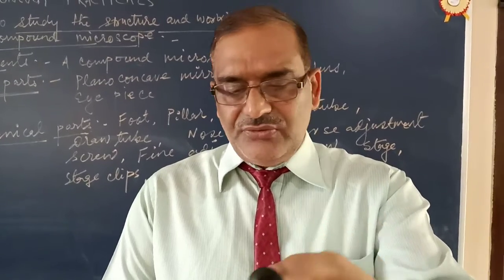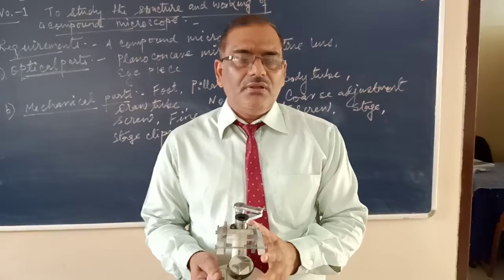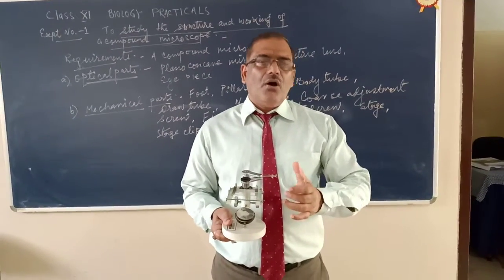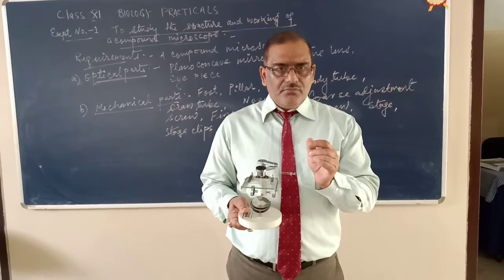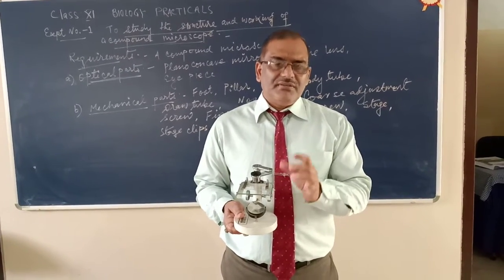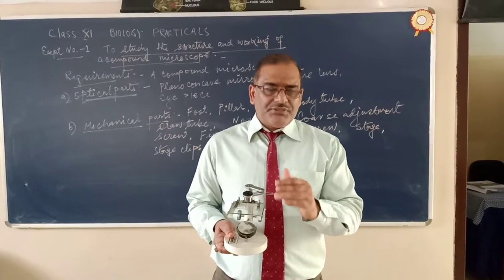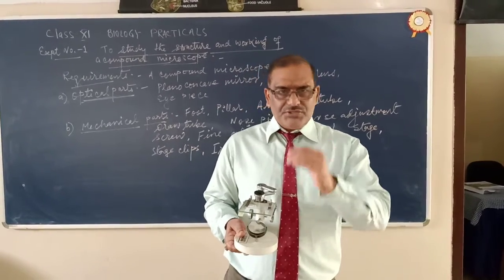So it has limitations. It is used for the study of slides or materials which are not very minute, which can be seen with low magnification.